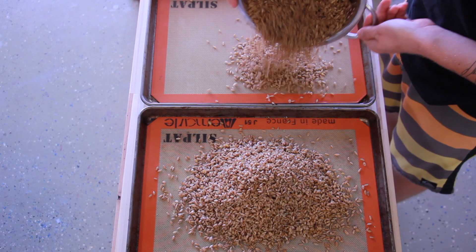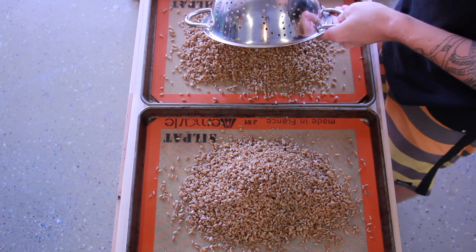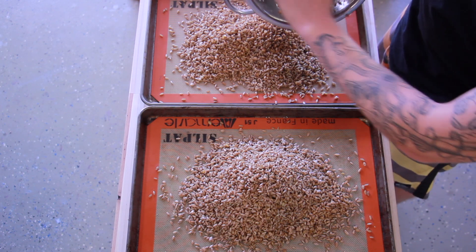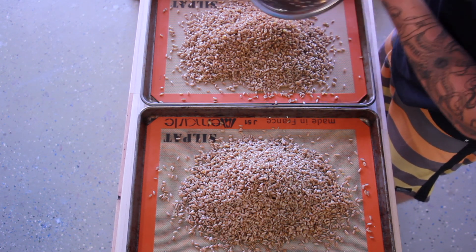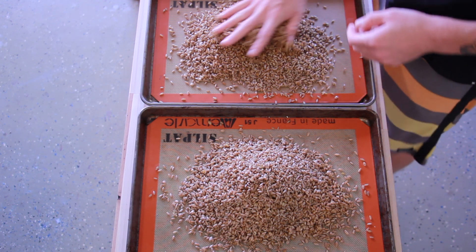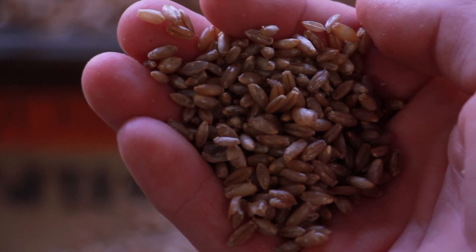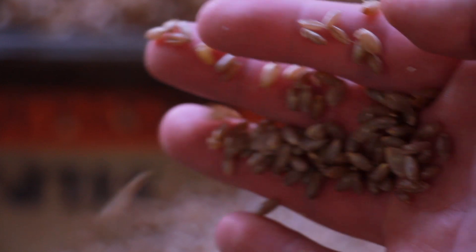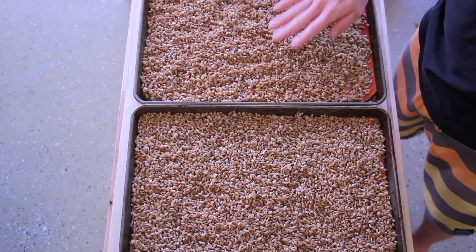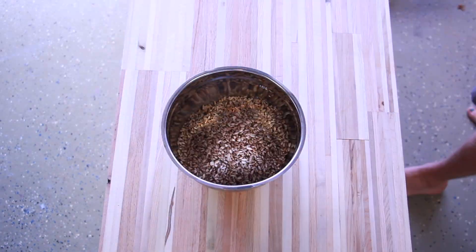Grab a couple of pans and we're going to dry out the surface of our grains. Dump the grain out onto a pan — the Silpat mats that you see here are definitely not required. Spread the grain around fairly evenly across the surface. The grain shouldn't be exploded; you might find a few kernels that are broken apart, but let it dry for about an hour. Then I just scraped them all into a bowl so that I can easily use them later.